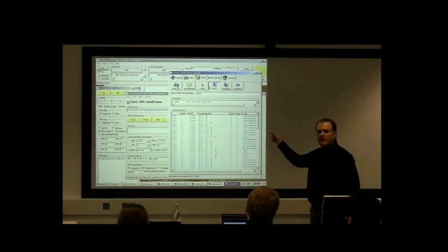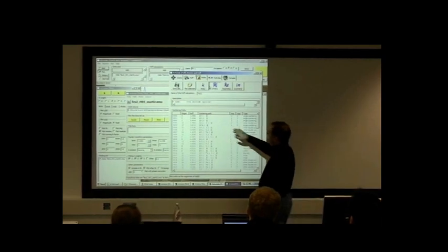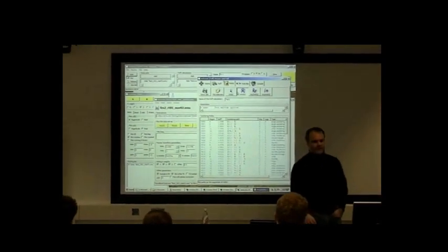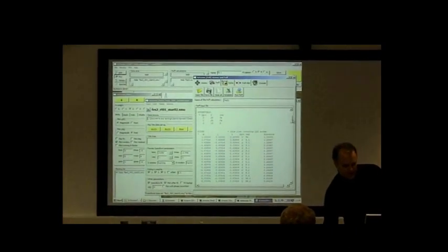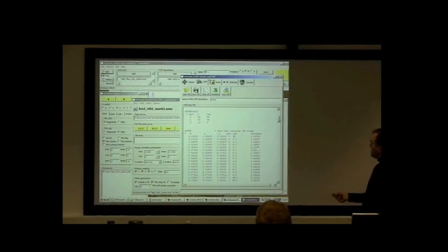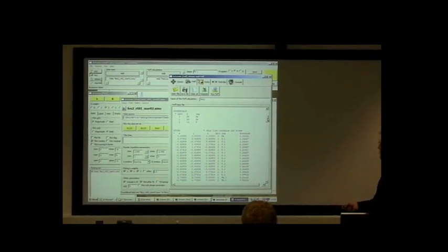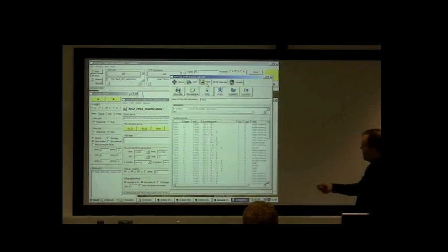of increasing path length. So the first three examples are pretty easy to understand. If we go back and look at the list of atomic coordinates, there were 6 sulfur atoms at one distance, 6 at another distance, and 2 more at that third distance. And we see that we have 3 single scattering paths.